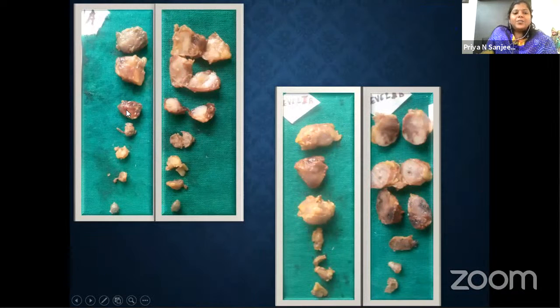And this is just two examples of level 1A and level 1B group of lymph nodes. Once you remove the lymph nodes from one particular level, arrange it in ascending or descending order of the size. And this is when the lymph nodes are intact, just write total number of lymph nodes present, and then do the sectioning. So cross section findings you can mention.